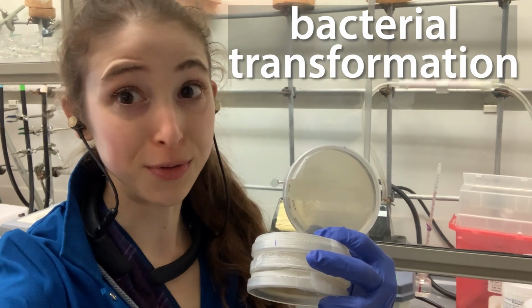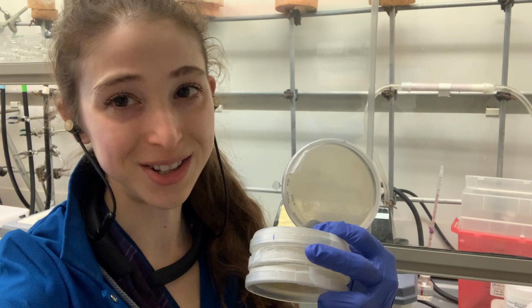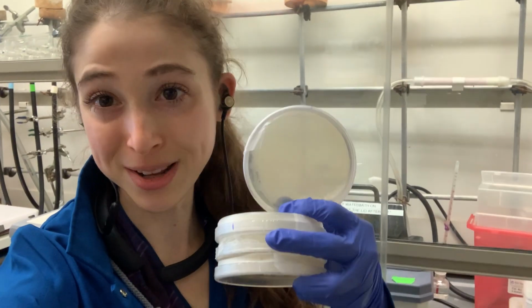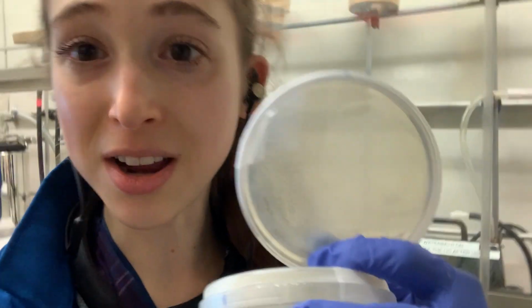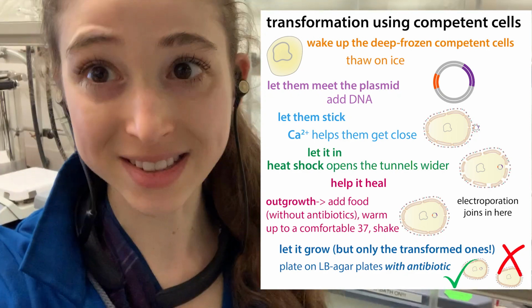I only recently transformed from a grad student to a postdoc, but it might not come as much of a heat shock to you that I've already had a number of transformative experiences. So let's talk about bacterial transformation using chemically competent cells and heat shock.